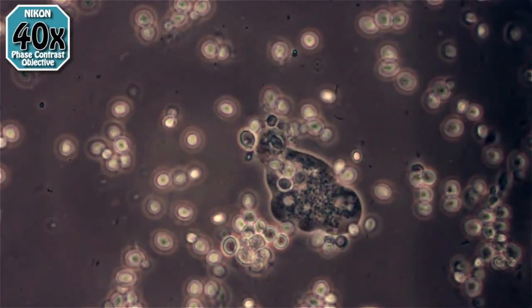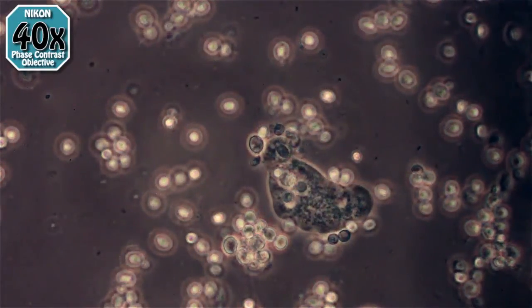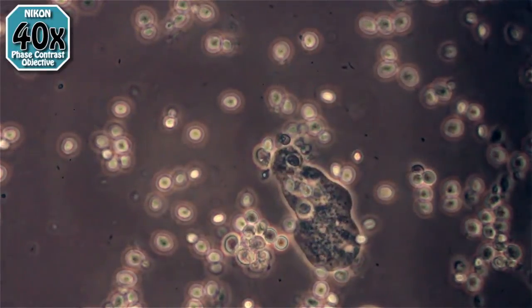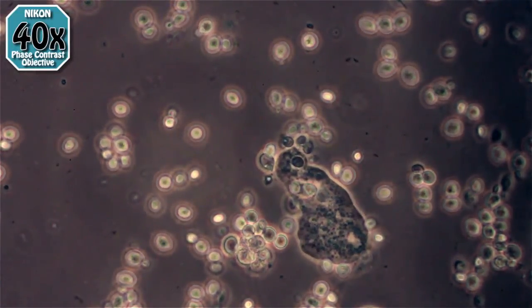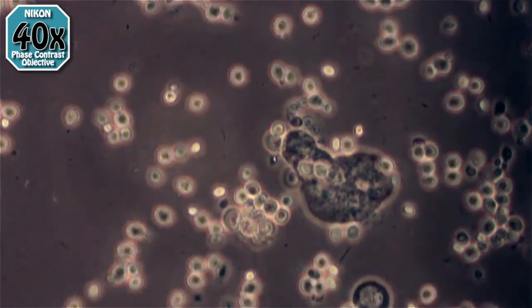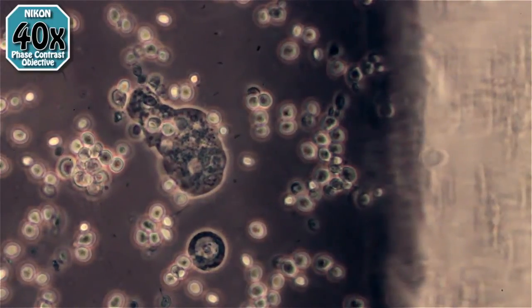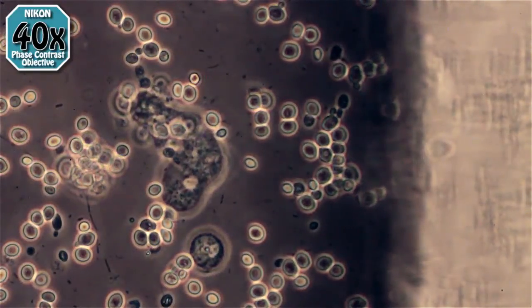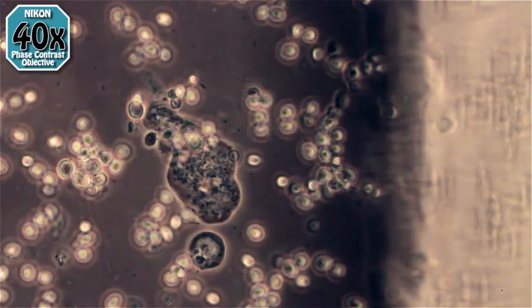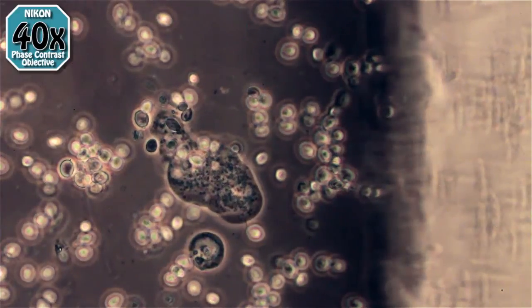The other day I put a tiny bit of brewer's yeast — the dried stuff, it looks like tiny granules — into the sample in the moss where it would get wet. That's what you see in the background here. These little round ball things are yeast cells; they lose their granularity as soon as they hit water and melt down into these little ball shapes.